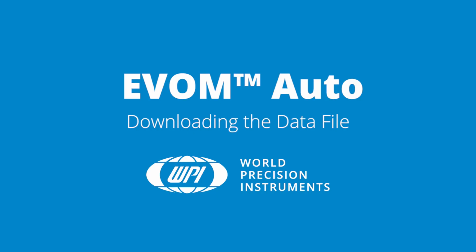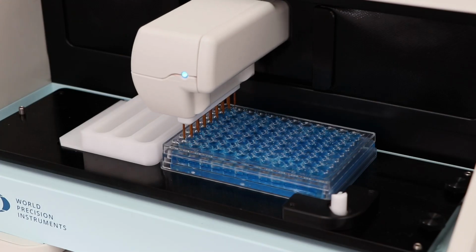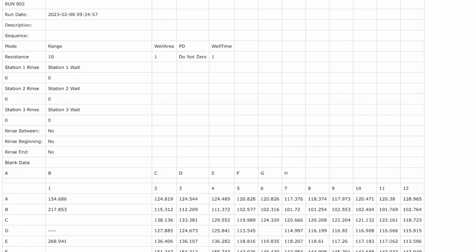Downloading the data file. Once a data acquisition run is completed, the data may be exported. This process exports all the runs performed on a plate into a downloadable, comma-delimited CSV file, which can be read by Microsoft Excel or Google Sheets. The downloaded file is immediately available.